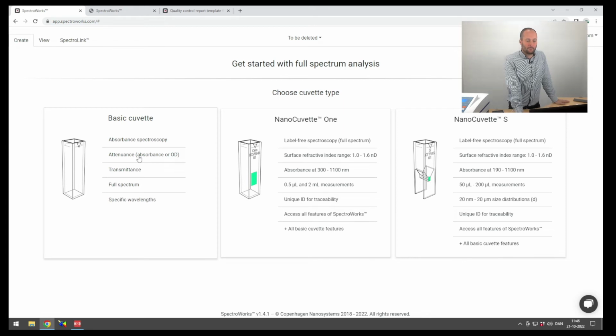So things have taken a bit of time, but the next step for us is to present this to our customer who's keen to get something new. They're also an early adopter, and we've worked with this company and this person for quite some years, so it's a good opportunity to start there. A fairly simple test, but as we can see, a very reliable test.